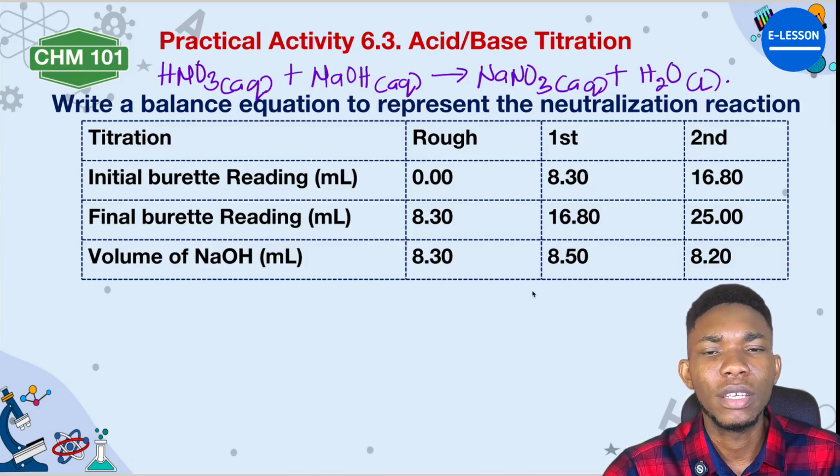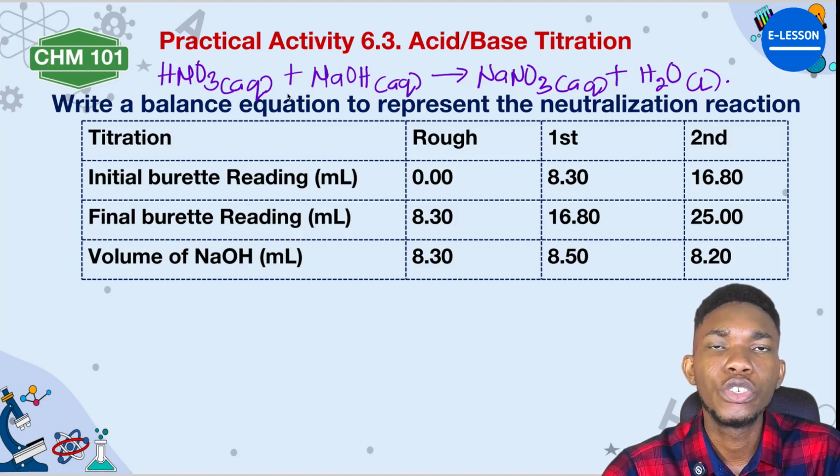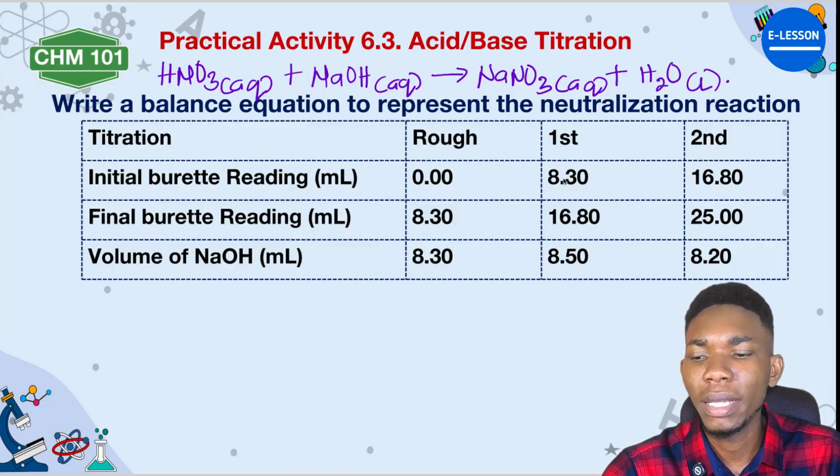Is that okay? So this is the balanced equation for the reaction. The ratio of acid to base is 1:1. Is that understood?